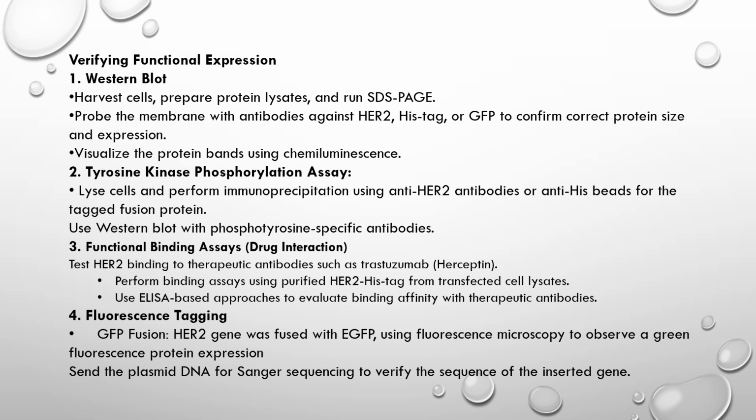In conclusion, through this project, we demonstrated a robust approach to clone and express the HER2 gene in mammalian cells. This result contributes valuable insight into HER2 functional behavior and its visualization using EGFP, paving the way for further cancer research and therapeutic development.